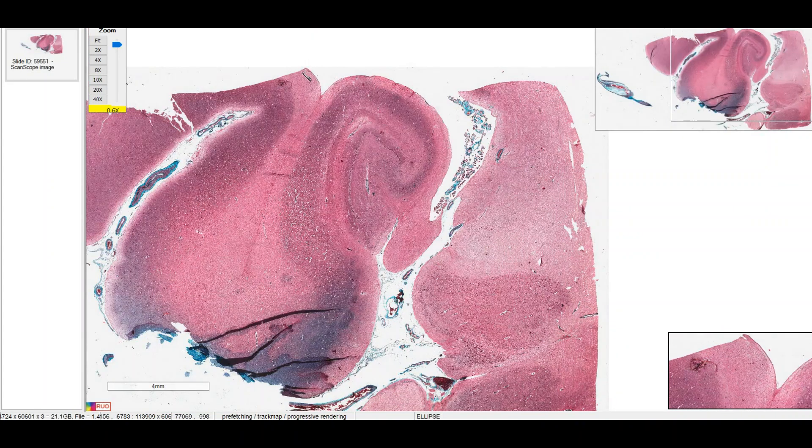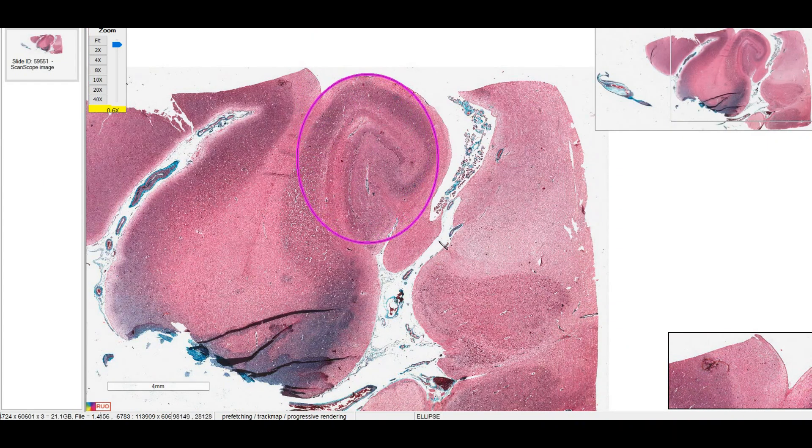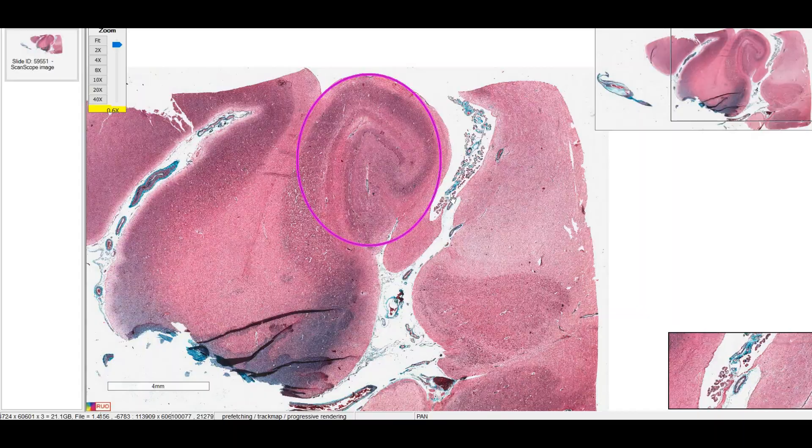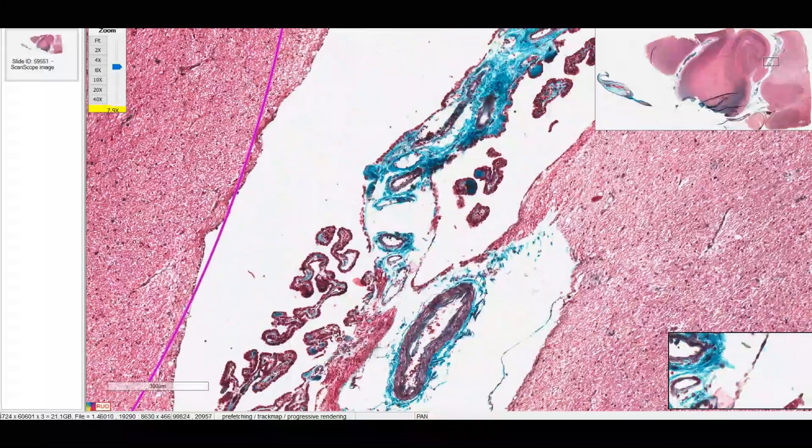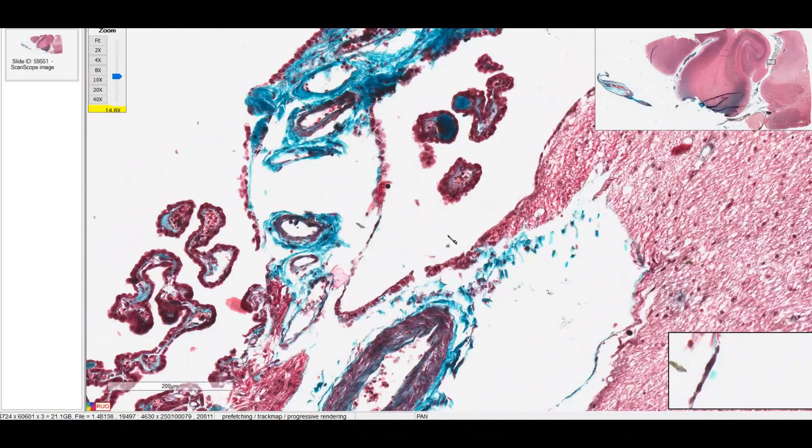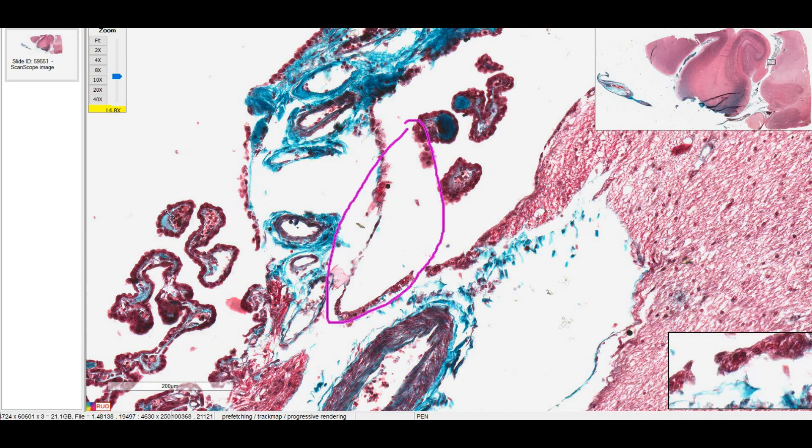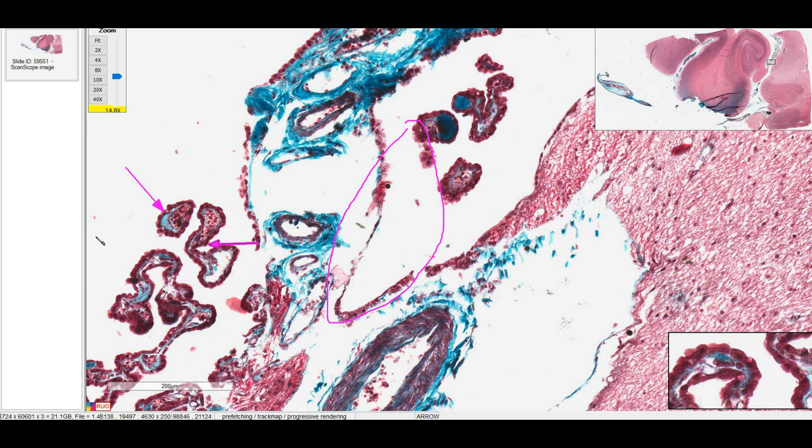On this next slide, we have some more cerebral cortex. We have the hippocampus right here with the lateral ventricle and the choroid plexus within it. So let's zoom over here. The manual talks about the choroidal lamina, which is where the choroid plexus connects with the rest of the brain tissue. It's a little messy, but you can see that here. And you can see all these little islands are part of the choroid plexus.